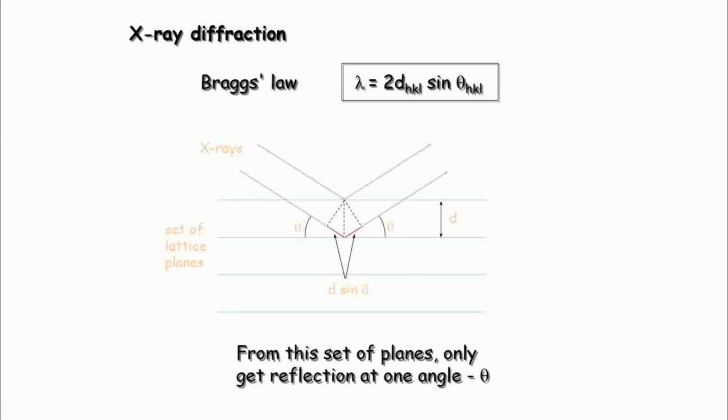And from here what we get is, as and when it goes deep inside, this angle as well as the distance keeps on changing, and this too will give you the expression which is called Bragg's law, which is depending on the lambda. So mainly it is dependent on what? It is dependent on this theta.